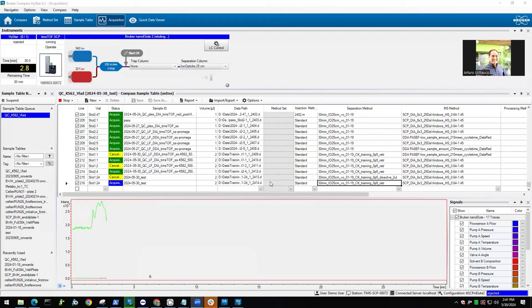The only thing I would recommend is, when you dry your samples, especially tiny amounts like single cells, to add an antioxidant to your samples, because I've noticed that when I dry tiny amounts, like a nanogram and lower, I see that oxidation of methionine goes through the roof. So you have a lot of oxidation. I add ascorbic acid. Ascorbic acid, vitamin C. It's good for us, it's good for our samples.